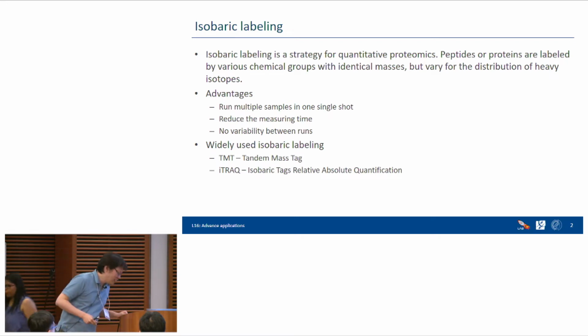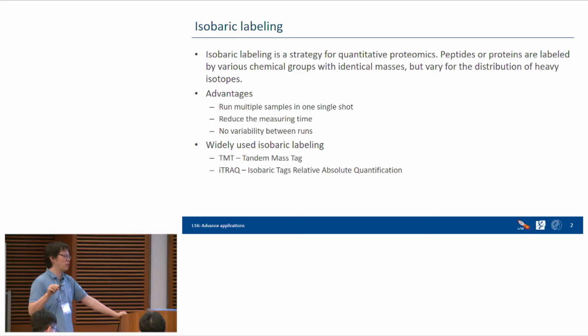So that's why I said that during this summer school, we have been asked so many times about TMT normalization and then a lot of things. In the current version, after running MaxQuant, the TMT table you get is raw intensity. It's not normalized, so you have to use some other package like limma or Combat to remove the batch effect. This is the current solution.